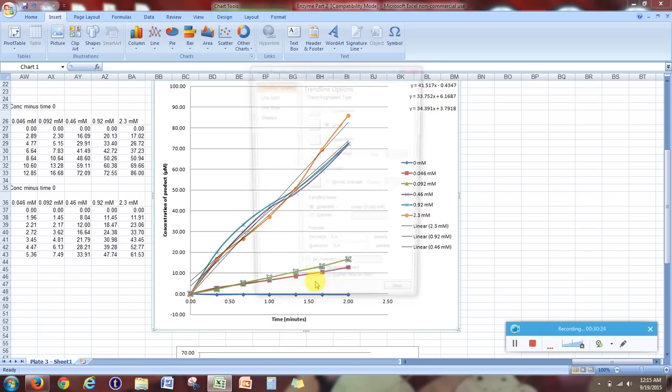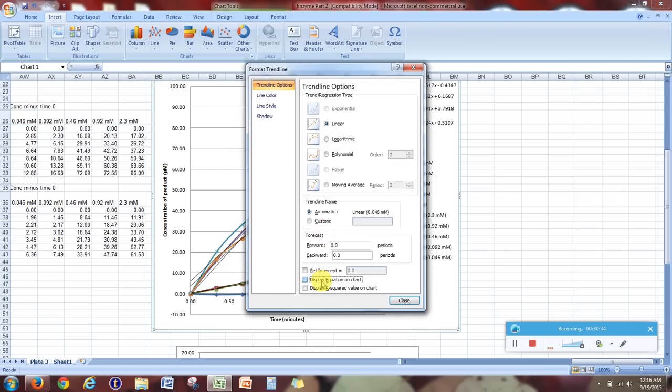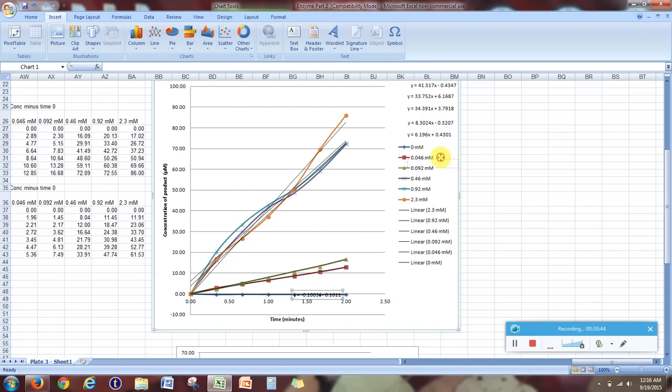And I'm sorry, this part may be a little bit tedious, but if I knew of a faster, more efficient way to do it, I would certainly be telling you about it. Alright, last one is the 0, of course. Slope is probably 0, or close to it.